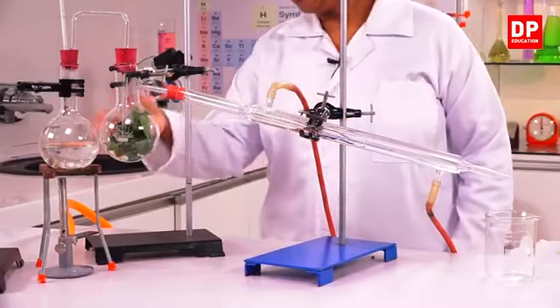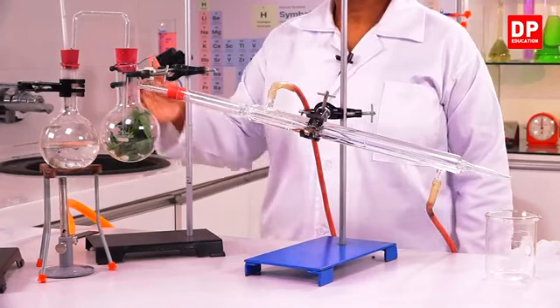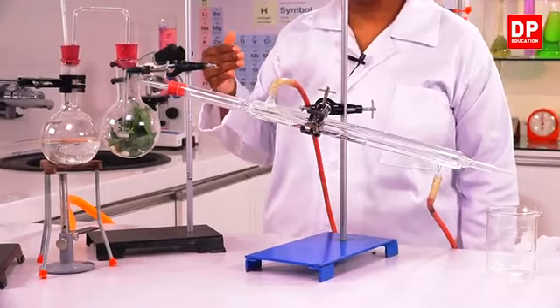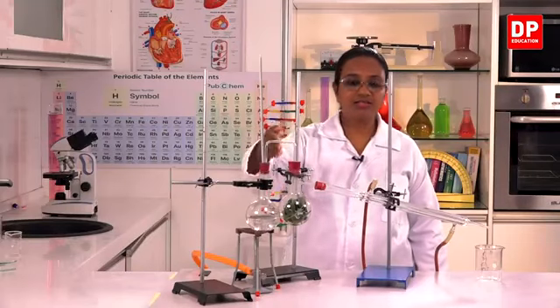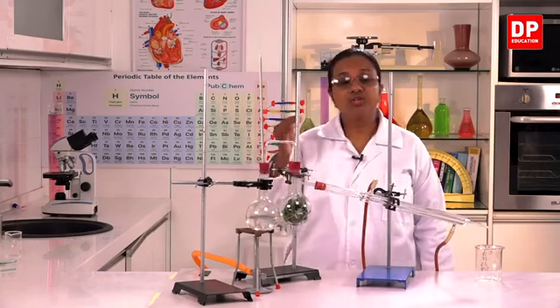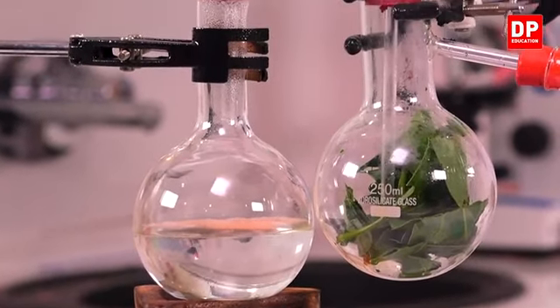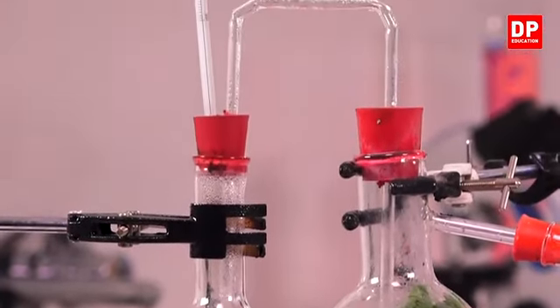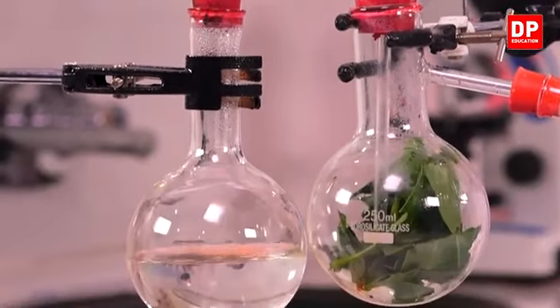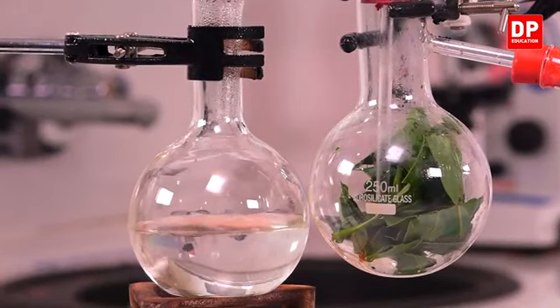So students, now the flask is supplied with heat. So the water inside the flask will boil and steam will be generated. And as you know, the steam enters into the second flask where we have the cinnamon leaves. So the steam makes the cinnamon oil present inside the cinnamon leaf to vaporize, and both the steam as well as the oil vapor mix together and they exit through the outlet of the second flask.